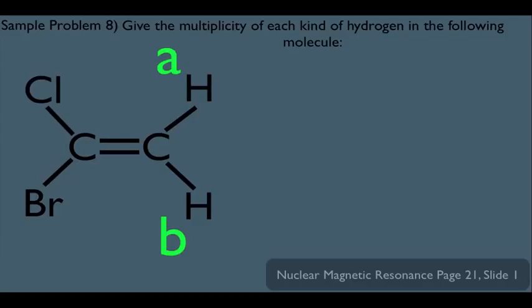And going on to figure out the N values for each hydrogen, the N value for the A hydrogen, notice what happens here. This is our A hydrogen. He's directly connected to this carbon right here, which technically means this is the neighboring carbon. But notice this neighboring carbon has no hydrogens on it. But technically, he does have this hydrogen right here, the B hydrogen, as a neighboring hydrogen.